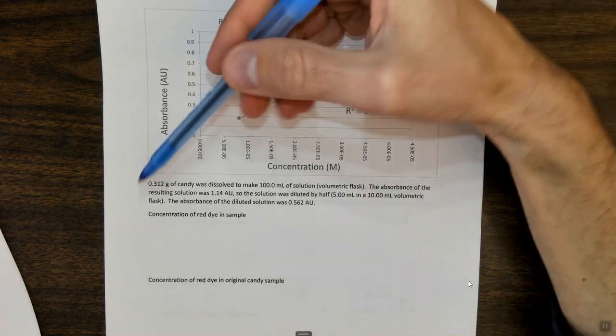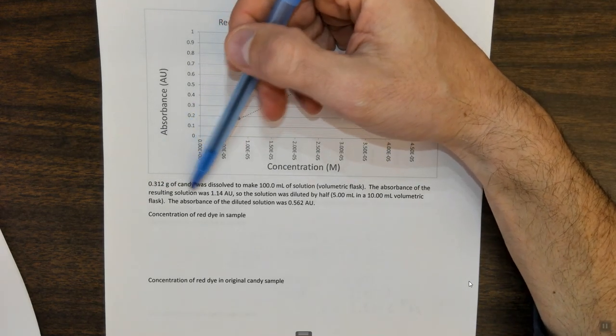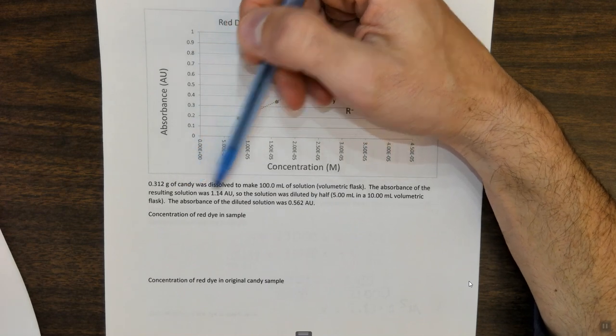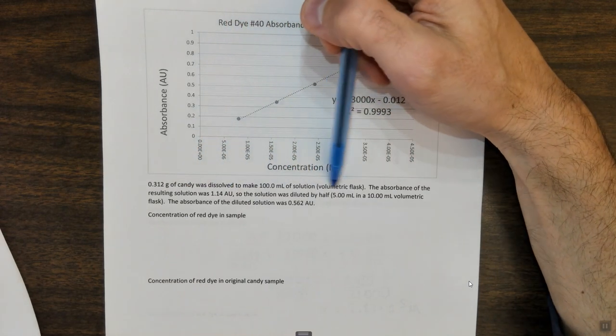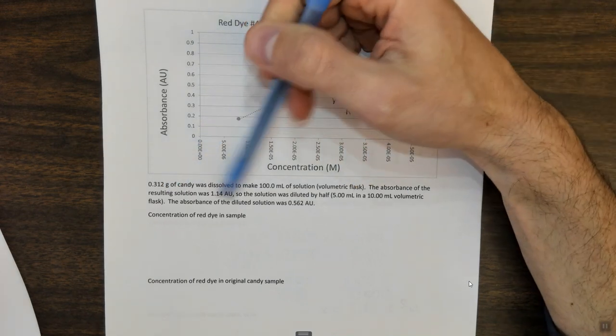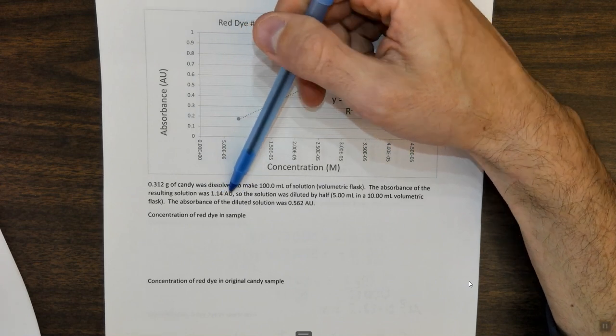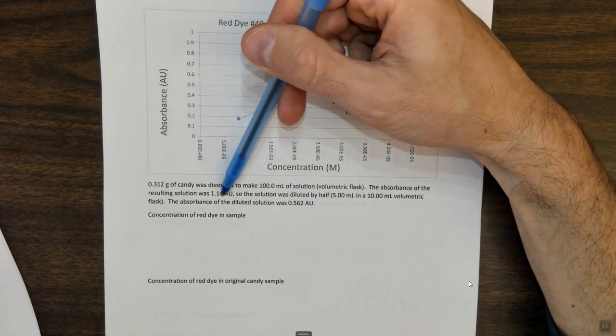I crushed up the candy, a 0.312 gram candy sample. So 0.312 grams of candy was dissolved to make 100 milliliters of solution in a volumetric flask. The absorbance of the resulting solution was 1.14 AU, so a little above 1.